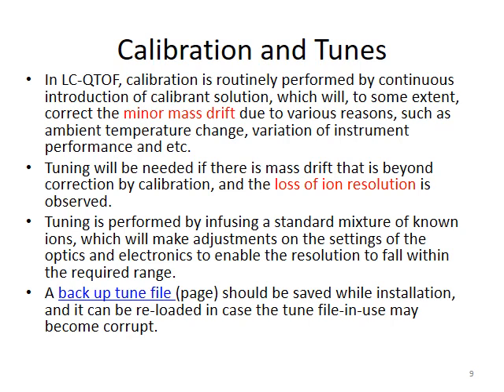Calibration usually is to correct minor mass drift, and what it does is to update the current tune file with a new equation that comes with new coefficients and so on. Calibration will not change any settings of optics and the electronics.